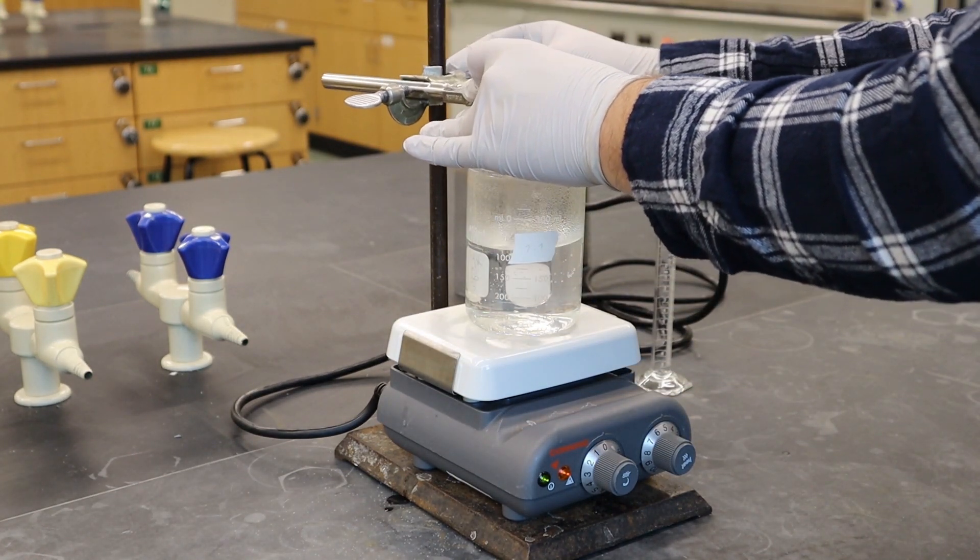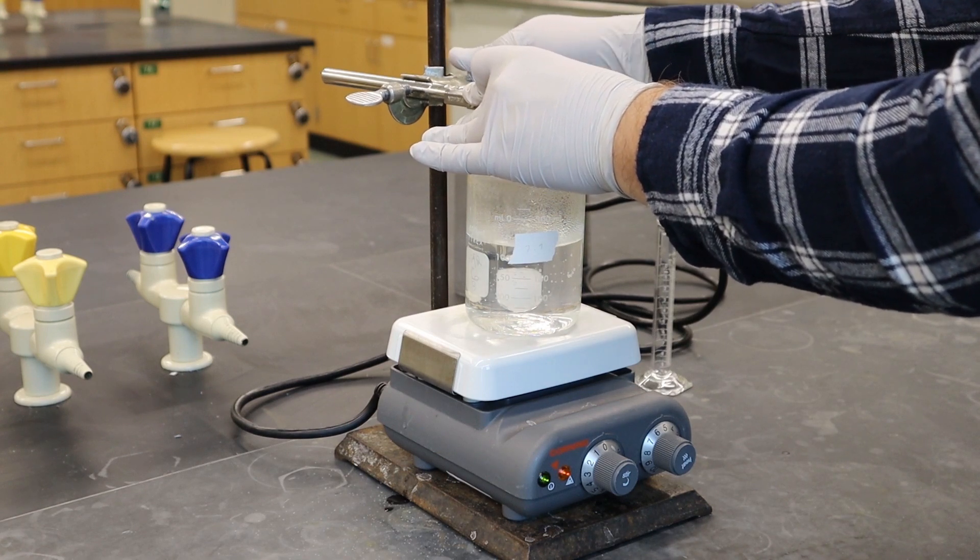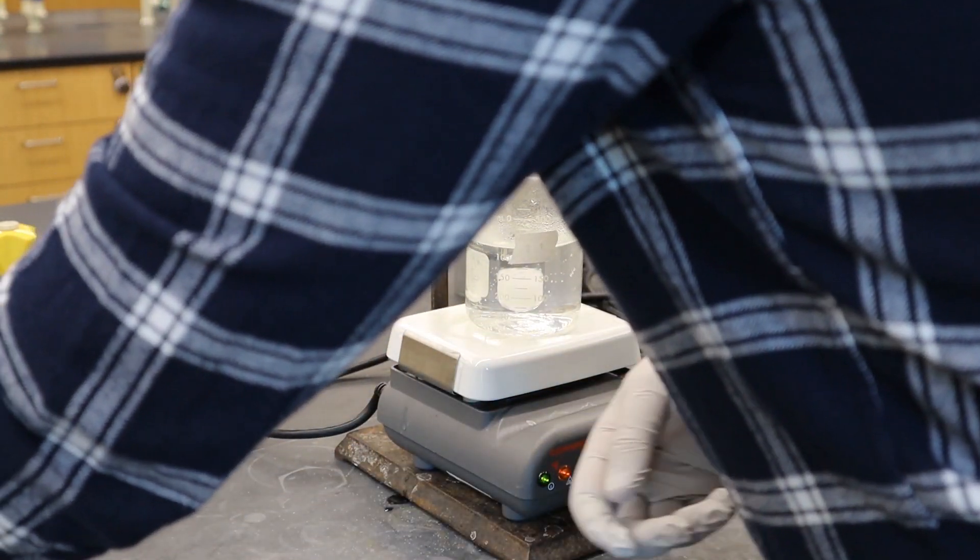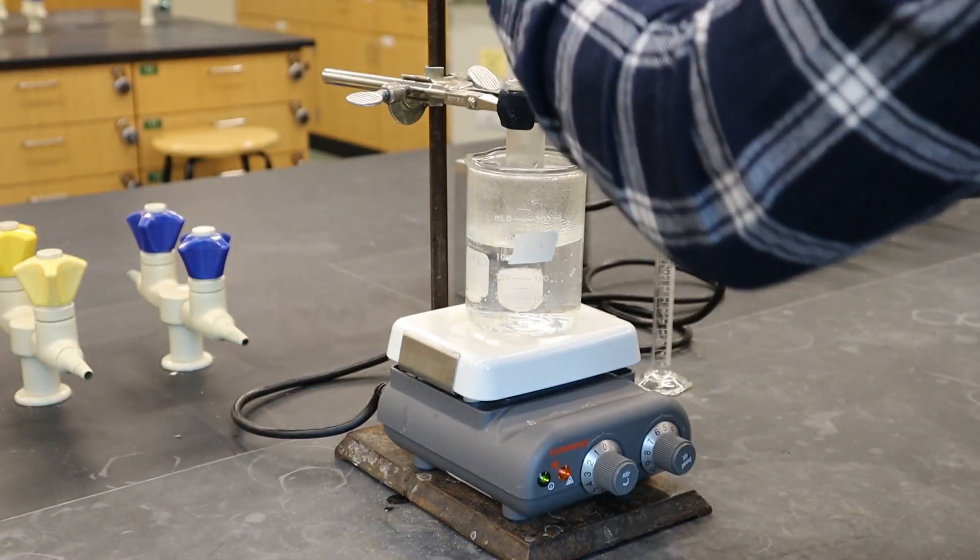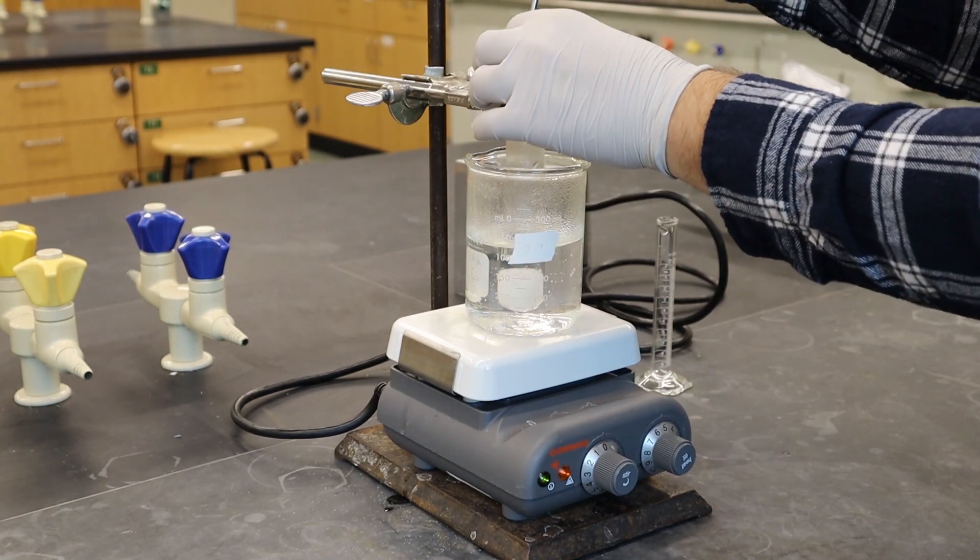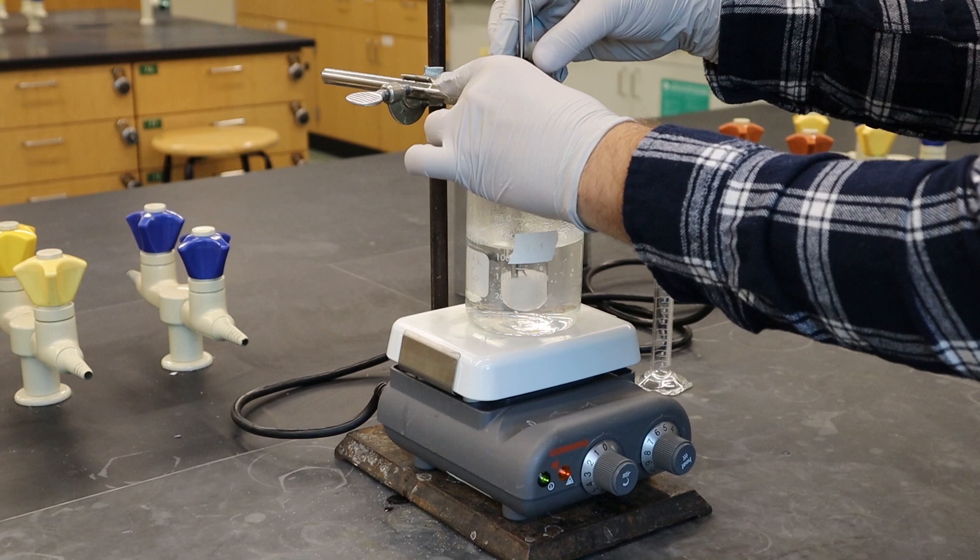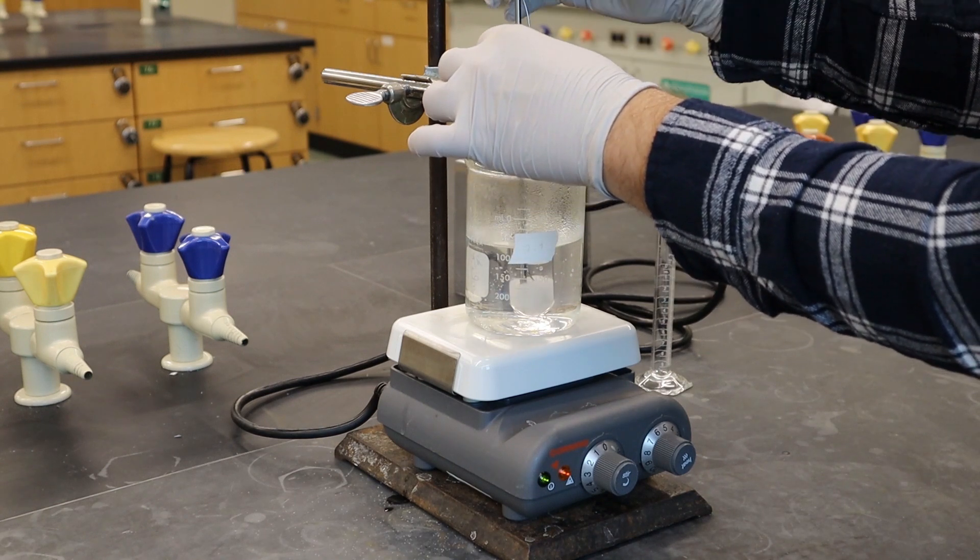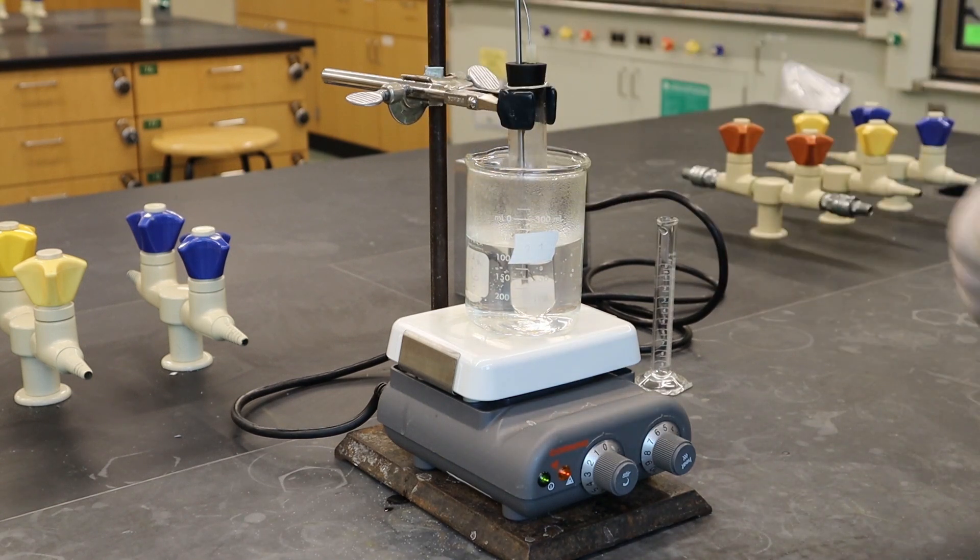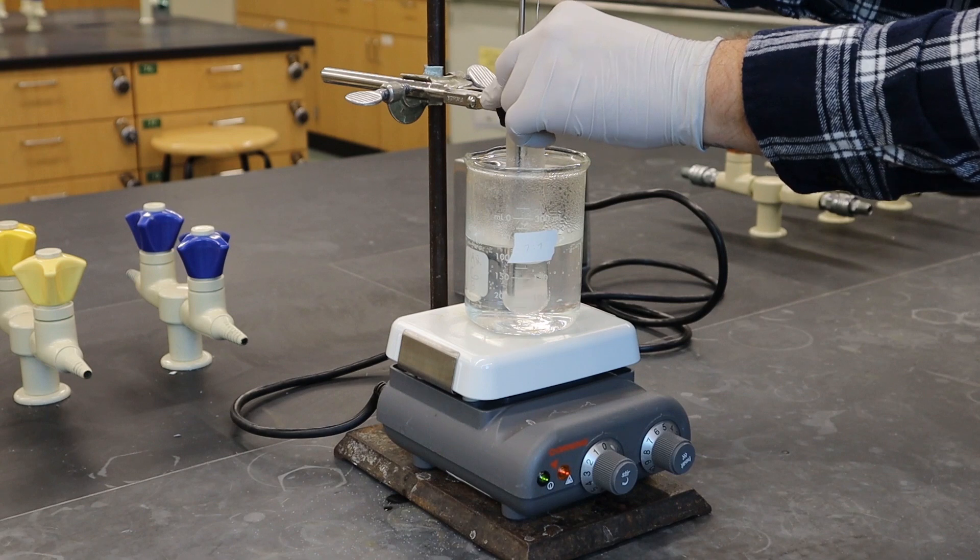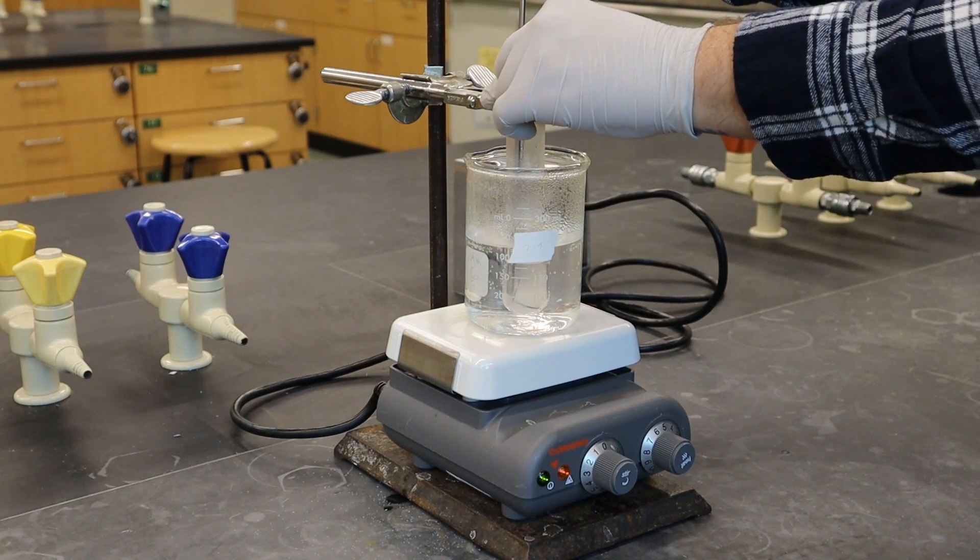So we're trying to measure the solubility product so we have to get it all dissolved and then we're gonna measure out when it stops dissolving. It's kind of the transition between the two. So this is gonna involve trying to be as accurate as we can about when it dissolves so it involves lots of stirring and temperature measurements.